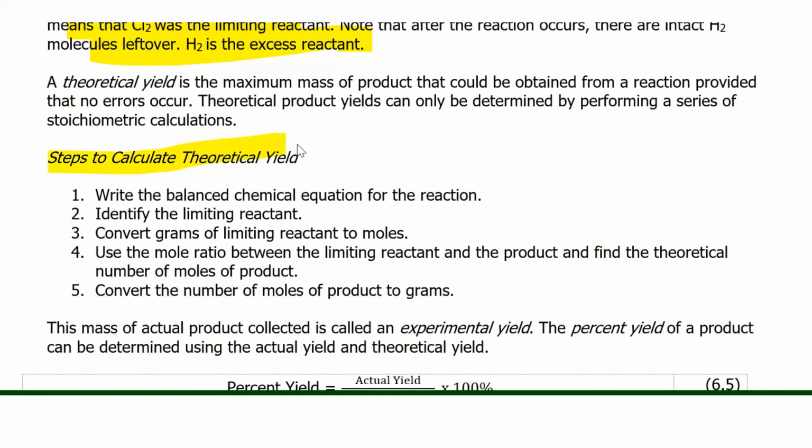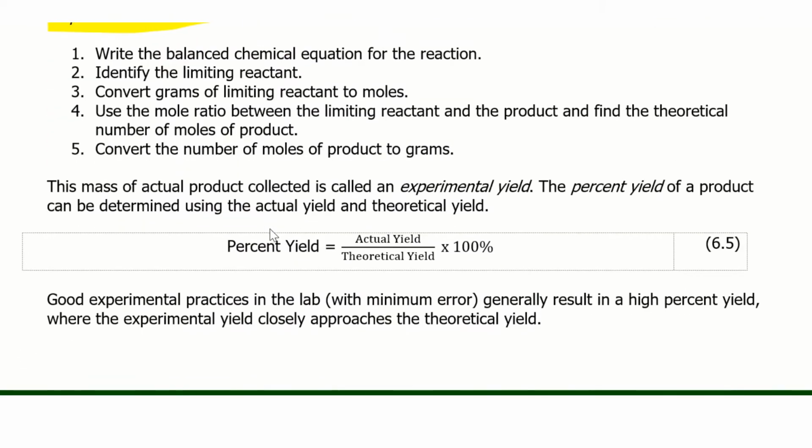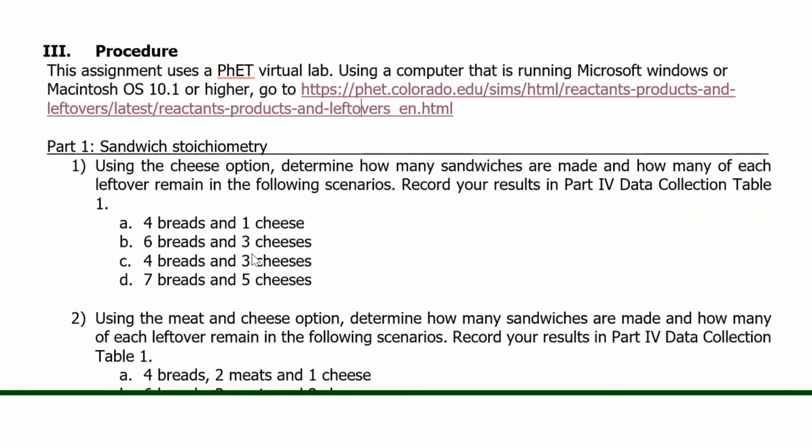And then I have the steps outlined to calculate theoretical yield, so that's definitely super useful. And then finally we end with discussing the calculation for percent yield. So in this lab, you are heading over to this PhET virtual lab. I've gone and opened that up already, but I do want to point this out to you first.